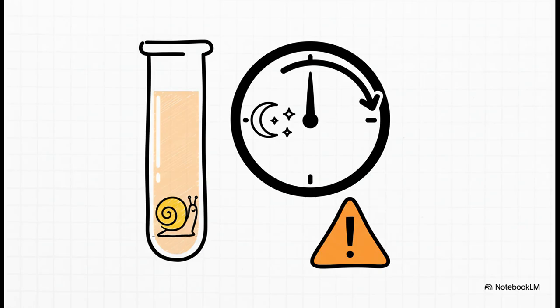And here we go, our second really important exam alert. Don't be too quick to call a negative result. If you check at 4 hours and there's no clot, you're not done yet. Some strains of S. aureus are just slow coagulase producers, so standard protocol says you have to incubate the tube overnight and check it one last time before you can officially call it negative.